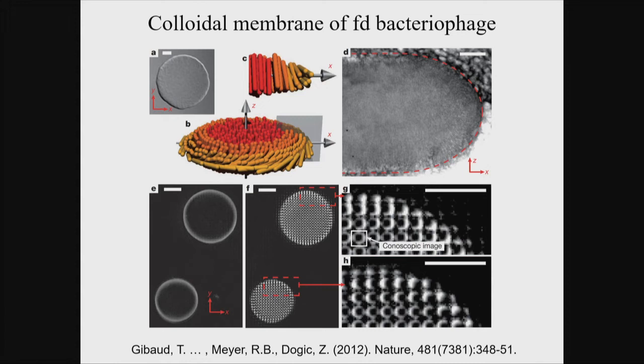We would like to take this further. Maybe you've seen a camera called a Lytro camera that can take pictures, and you download them to your computer. The picture looks like a regular camera picture, and then on the computer you can determine where you want to put the focus.